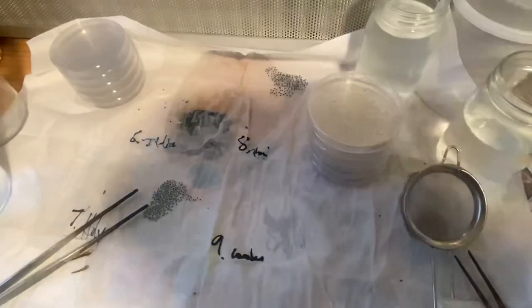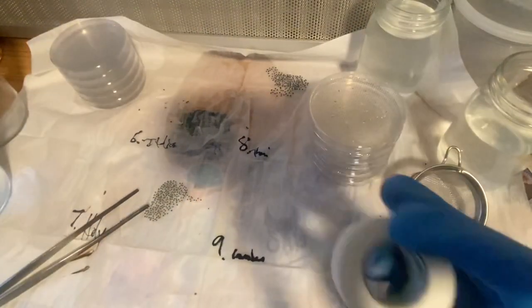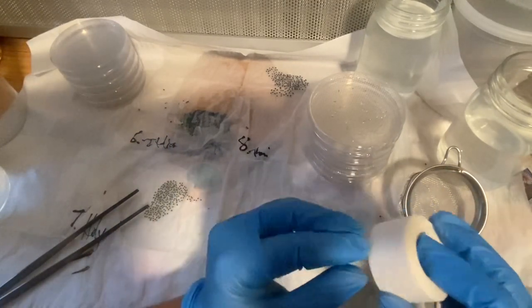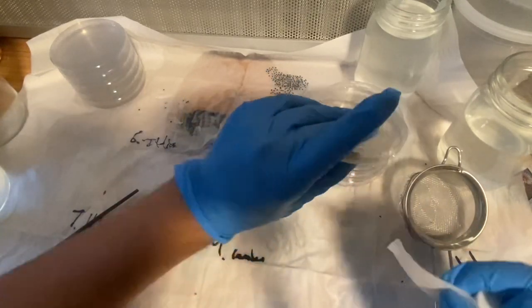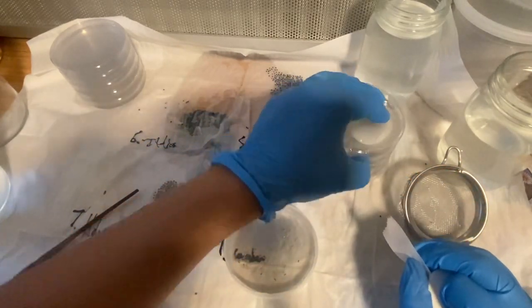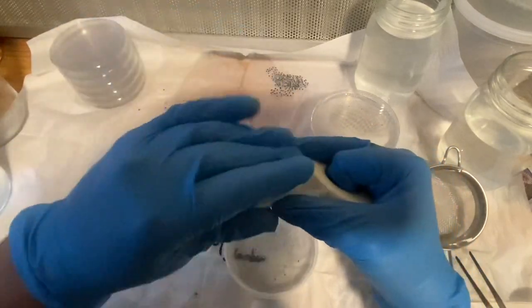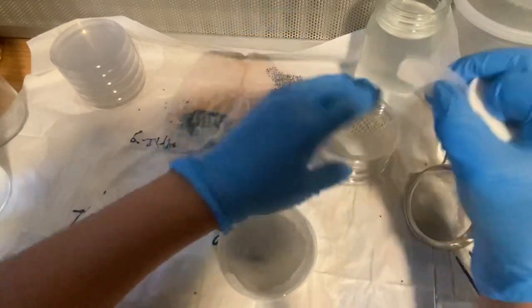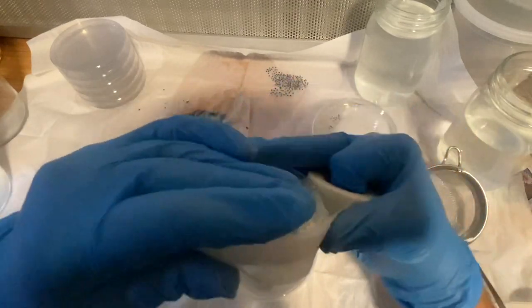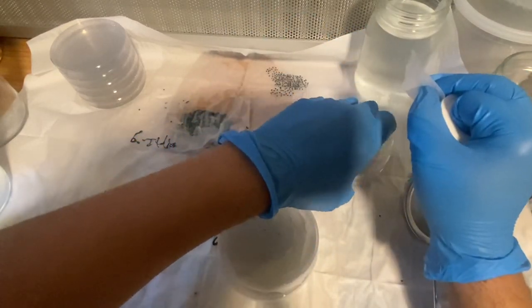As I take some micropore tape, I had to get a new roll. These petri dishes, you could also use parafilm, you could use plastic shrink wrap, whatever works best for you that keeps your plates sterile. This works best for me. I also kind of pinch the plate a little bit to help really keep that lid down, making it super secure, so that no contamination can enter.